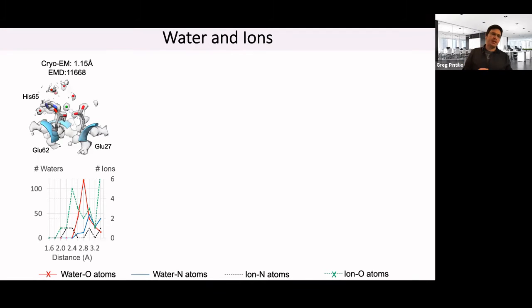It could be zinc. It could even be iron, right? Because apoferritin binds iron ions, so it could potentially also be that. So there are still some questions related to what type of ion it is, because these ions tend to have similar properties, so they could bind in similar ways in such binding sites.